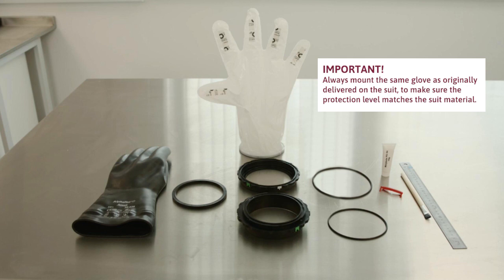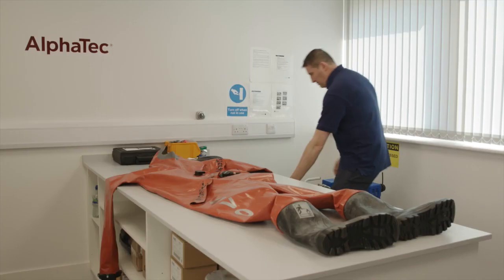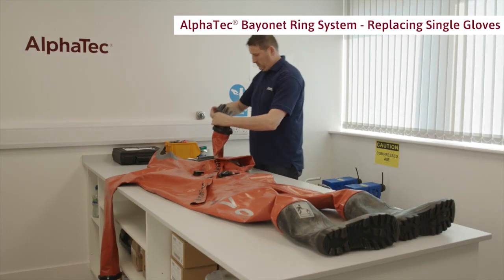Important: always mount the same glove as originally delivered on the suit to make sure the protection level matches the suit material.